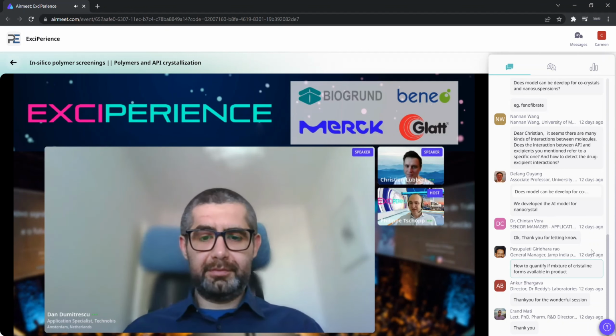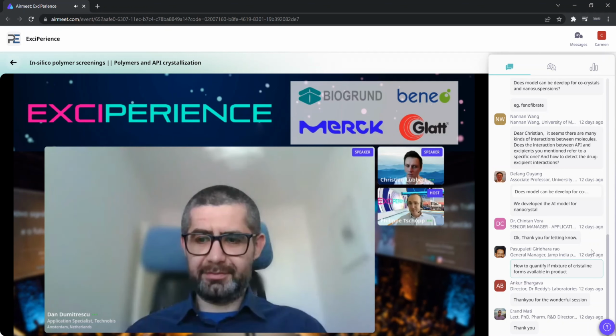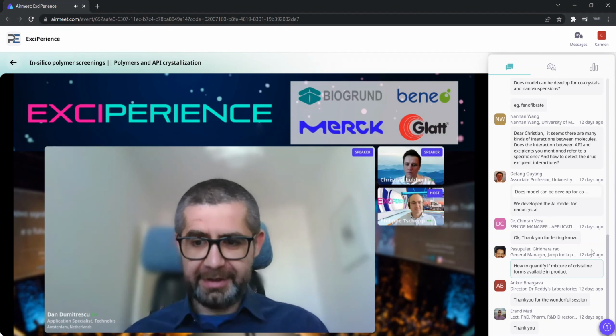Very good. And Nico says, hey Dan, I'm coming from the GMP environment. Is it possible to perform calibrations or do an SST on Technobis products to guarantee that the results are correct? Short answer is yes. Most of our customers work in a GMP environment.